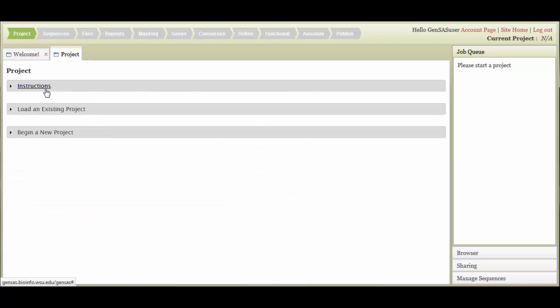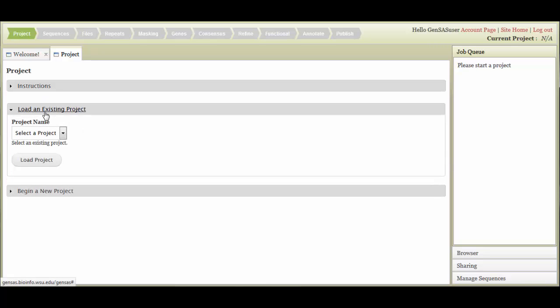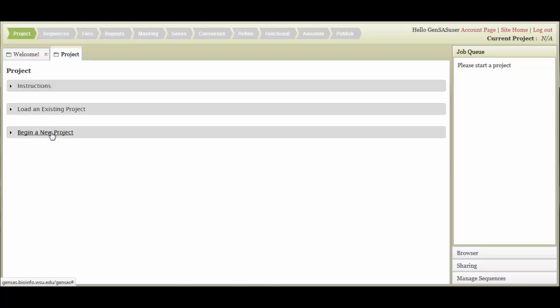Under the Project tab, you have two options. You can either open an existing project, which includes projects that have been shared with you by another GenSaaS user, or you can begin a new project.